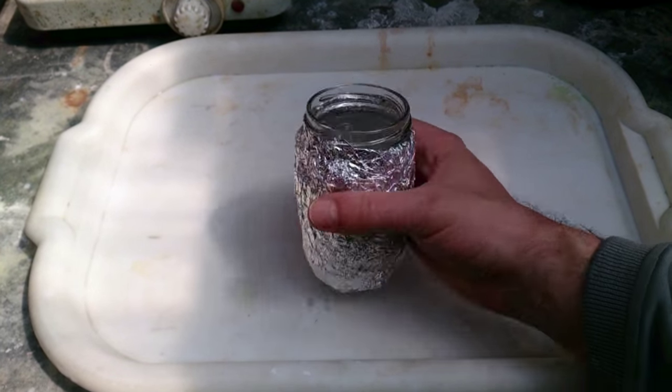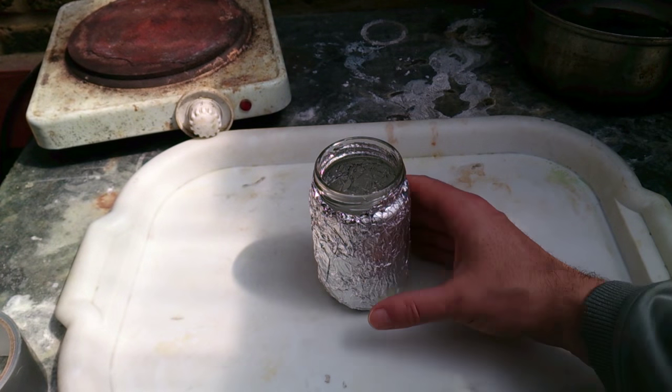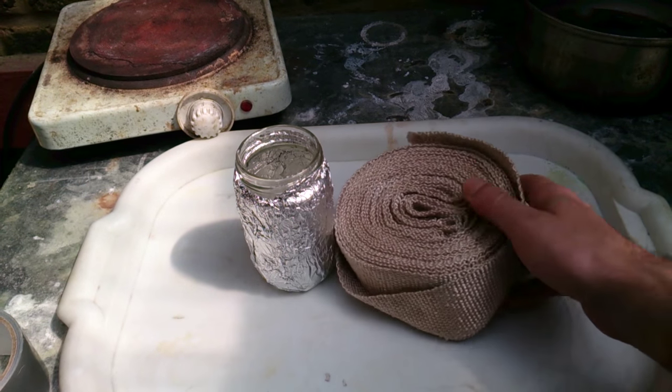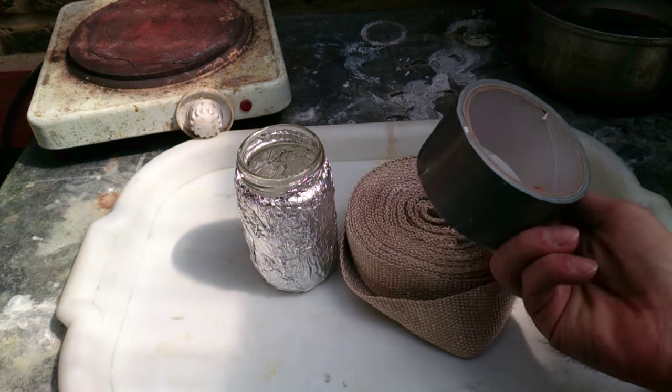Actually, glass is not afraid of heat itself, but it will break when heat is applied unevenly or if it experiences what's called thermal shock. To dispense the heat evenly, we've wrapped it in foil. To dispense the heat even more evenly, on top of that you can put any kind of thermal insulator. I used exhaust wrap I found in the garage and fixed everything using duct tape.